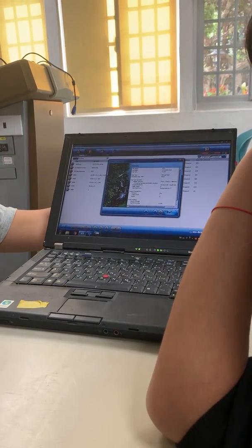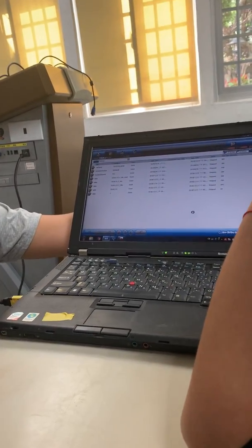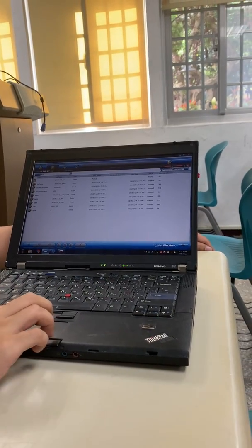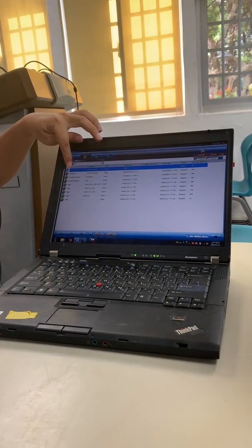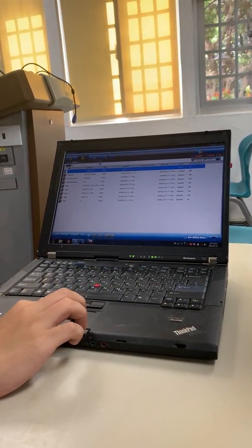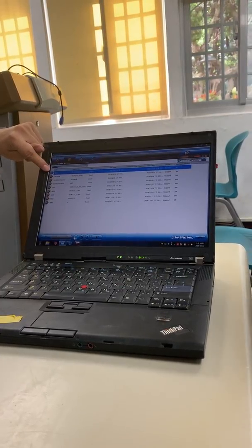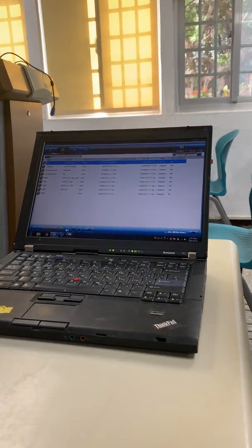After finishing the settings, click the start button here. After starting, you will see a small running person icon appear. Every time during the experiment, you need to make sure that icon is running. If it is not running, you will have wasted everyone's time entirely.